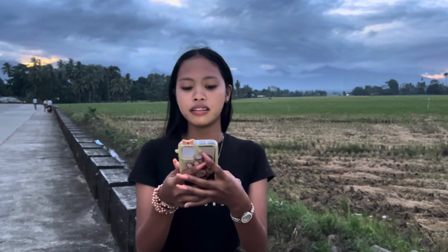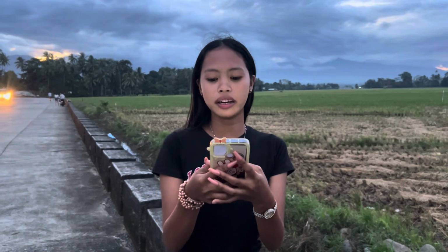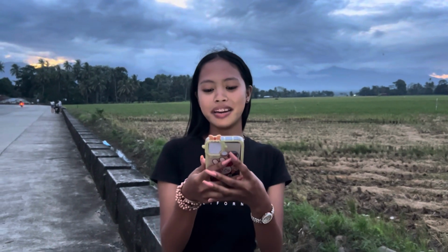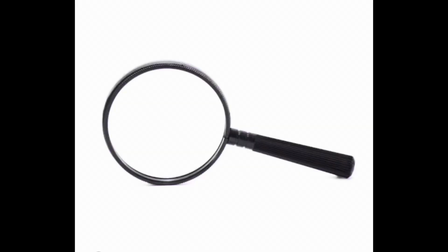The lens is used to magnify small objects such as insects or individual leaves on plants, so that the viewer can better see them and the details on them.